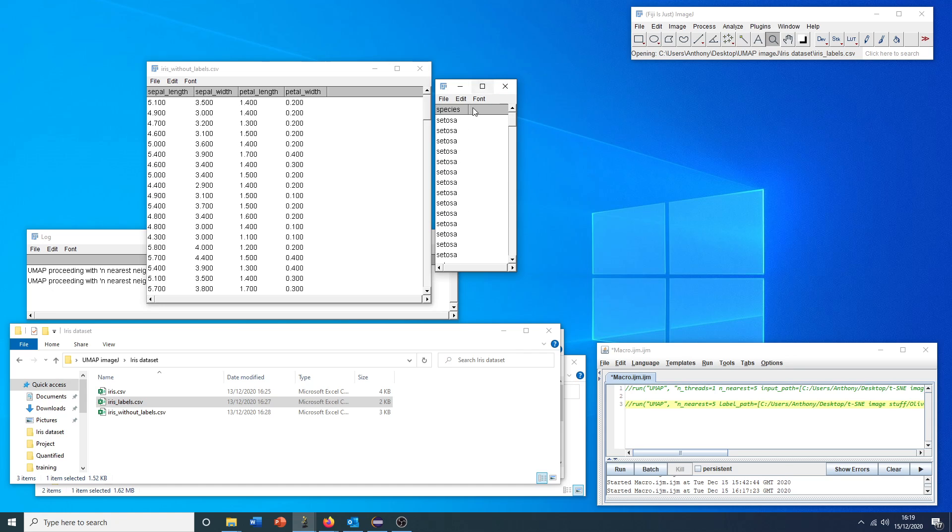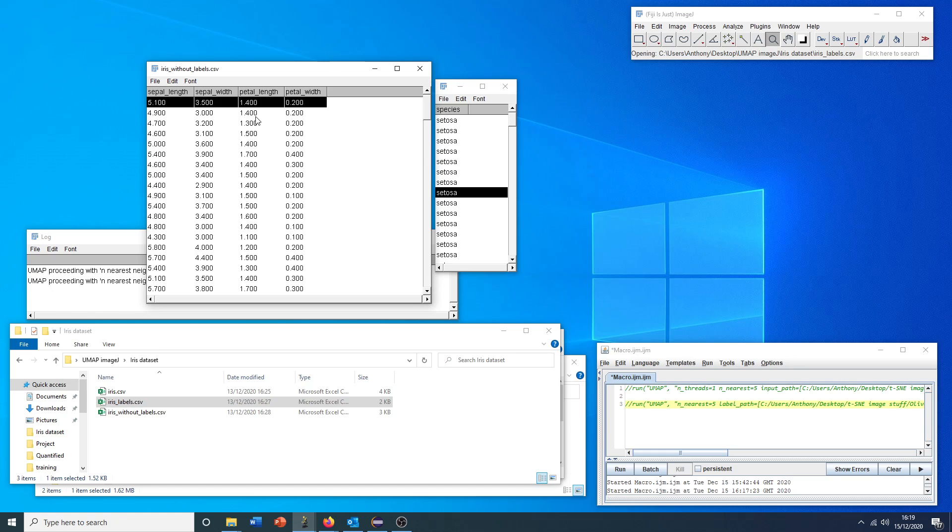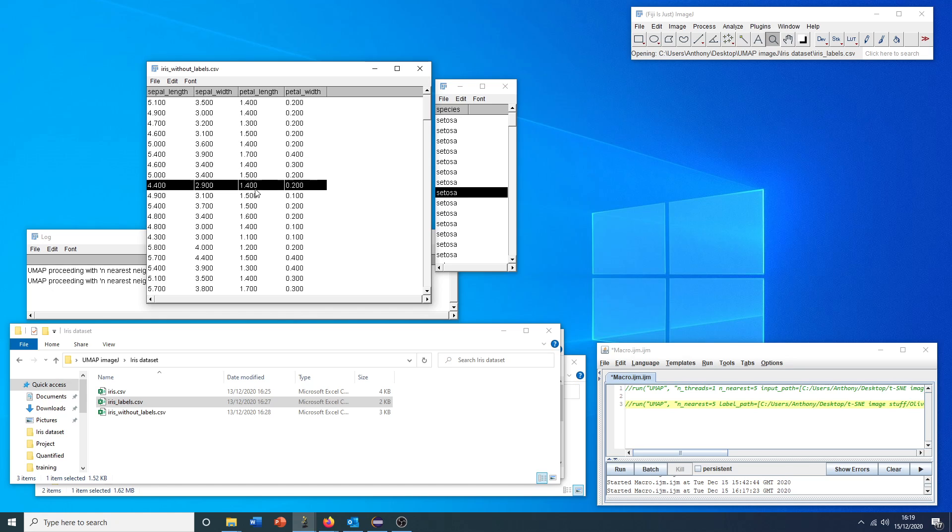Again, in a single column as the plugin expects it to be in. Just to reiterate, the most important thing isn't that they're in order, which they are here, but that the order of this column is the same as the order of this dataset.